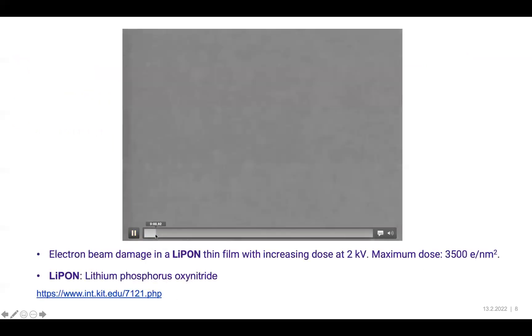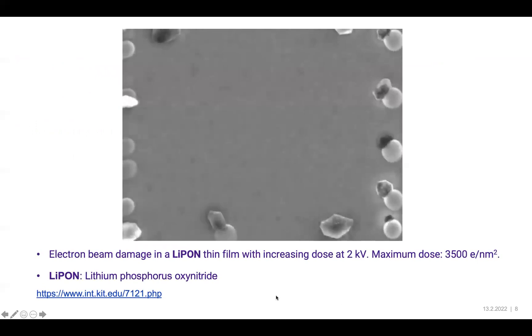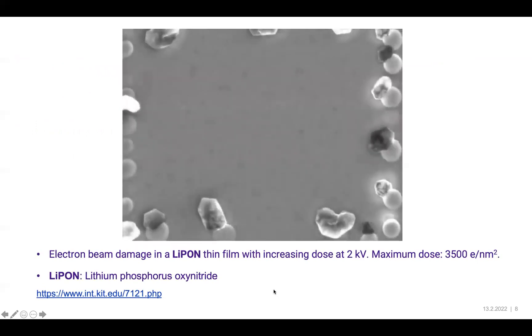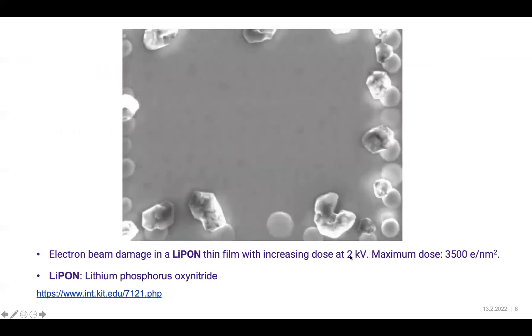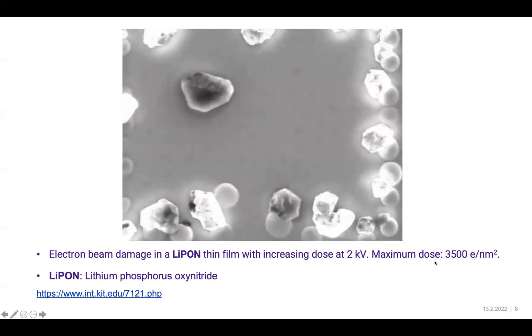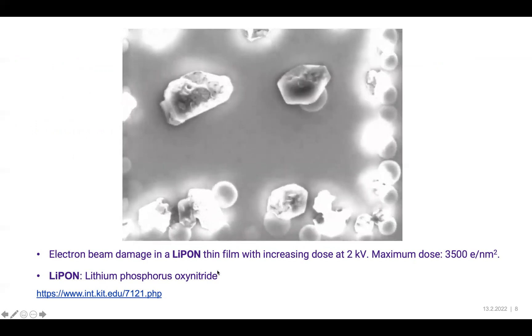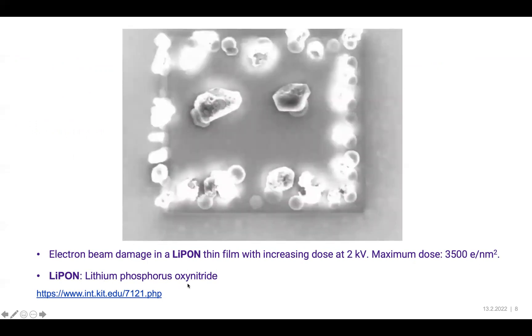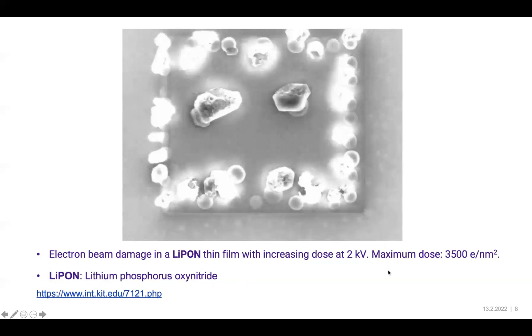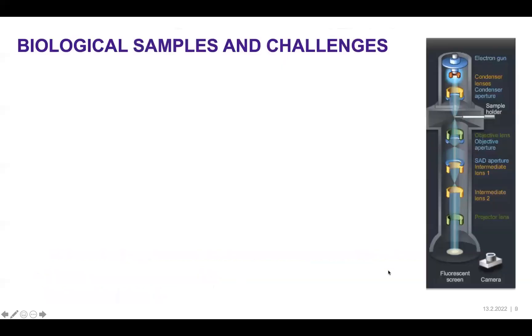Here is a movie showing how scanning electron microscope imaging also affects samples. If you have extremely low kilo electron volts but a dose of even 3,500 electrons per square nanometer, some sensitive samples such as lithium phosphorus oxy nitride undergo immediate beam damage. It is even more amplified when we go to biological samples.